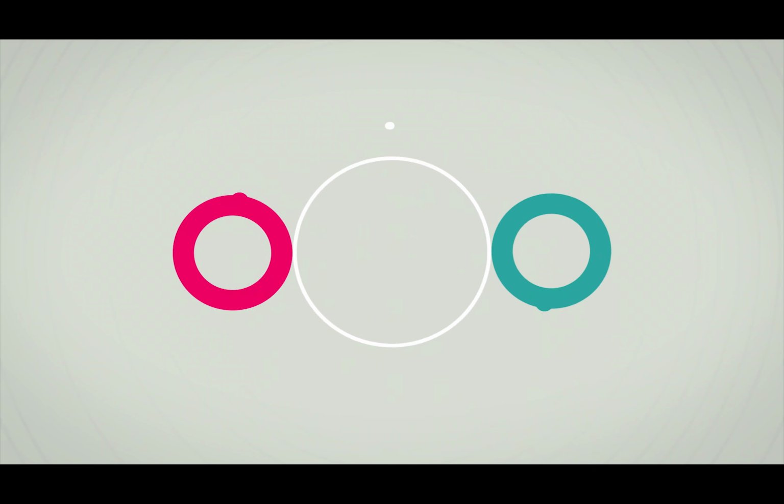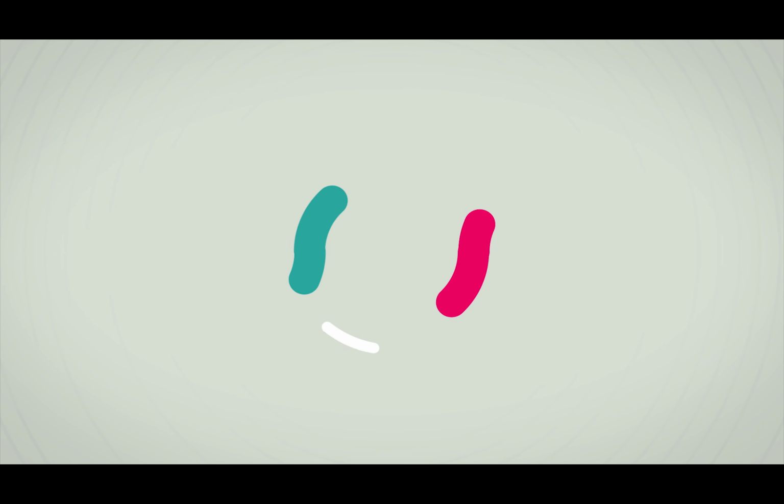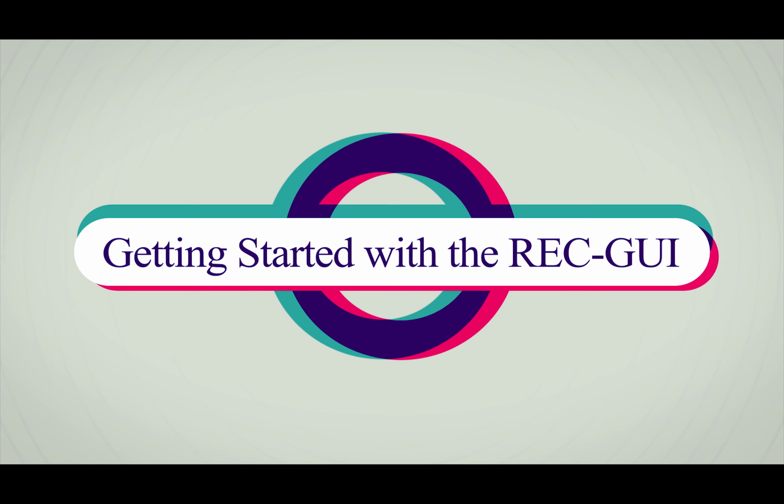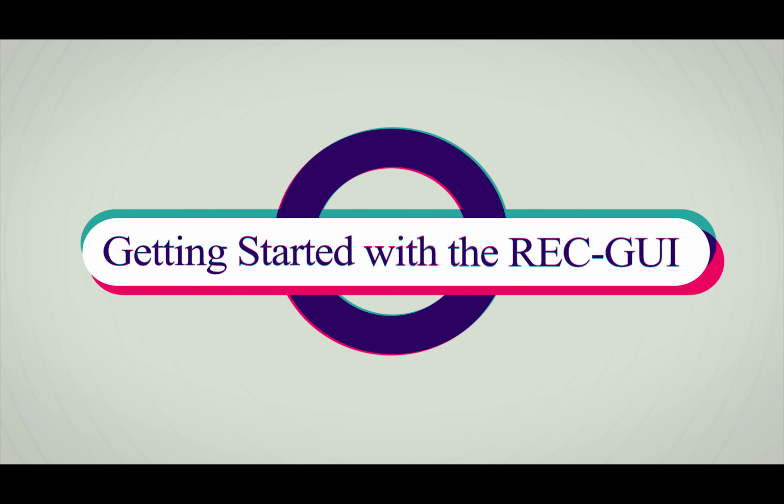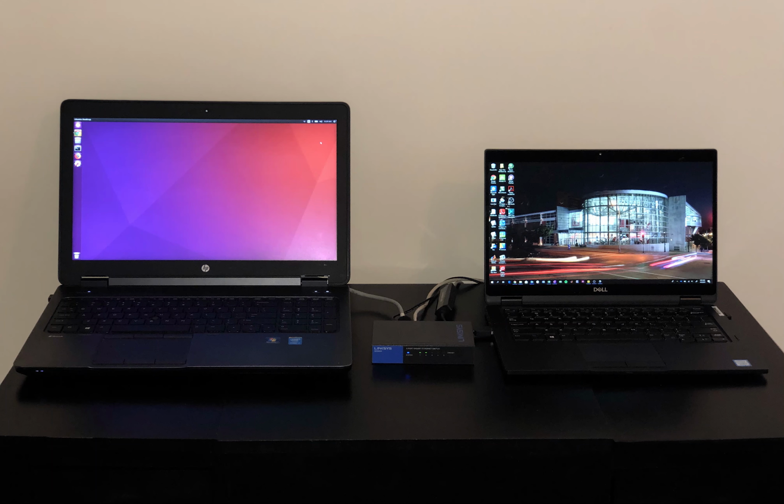Hey everybody, today I'll be showing you how to set up the IP address on Linux, Windows, and Mac OS for use with the real-time experimental control with graphical user interface, REC-GUI. For more details on the REC-GUI and its applications, see the real-time experimental control with graphical user interface technical user manual, or tutorial guide.